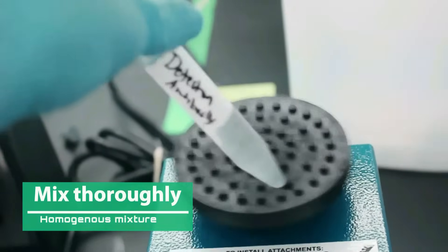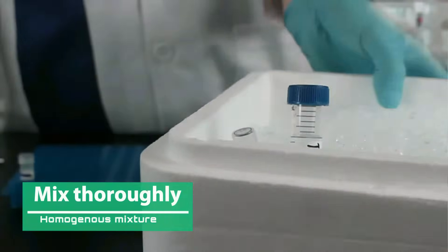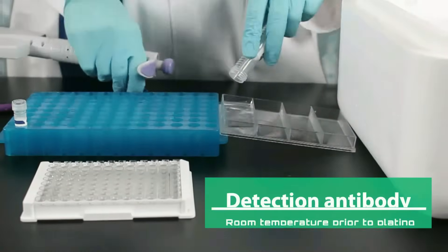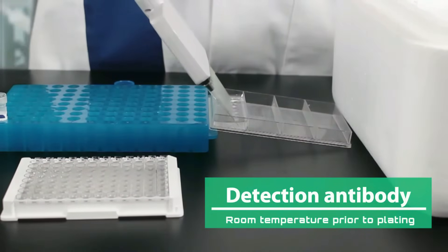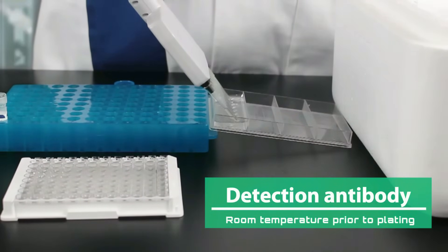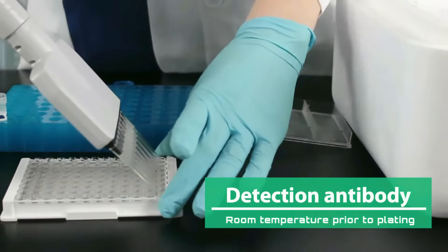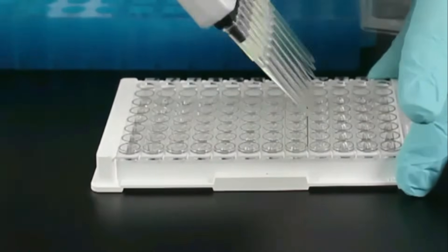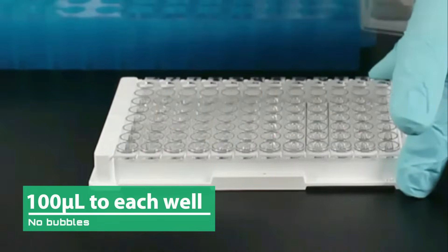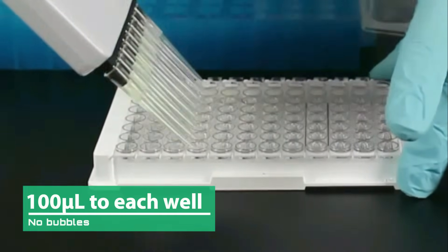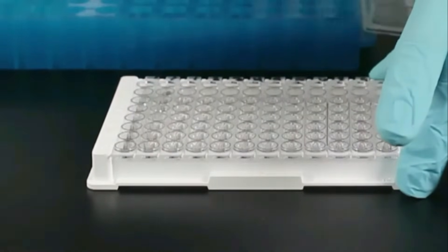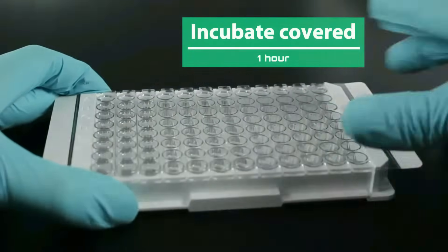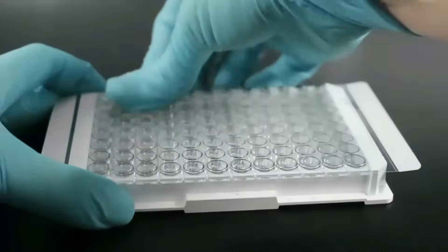Make sure the detection antibody is a homogeneous mixture by using a vortex. The detection antibody should be the same temperature as the plate prior to plating. Add 100 microliters to each well and make sure there are no bubbles. Cover and incubate for one hour. The biotinylated detection antibody will find that bound antigen with high specificity.